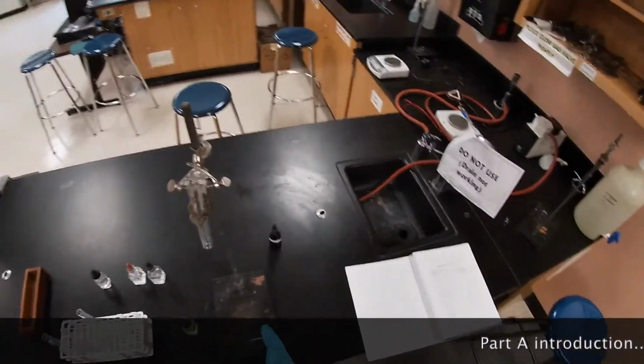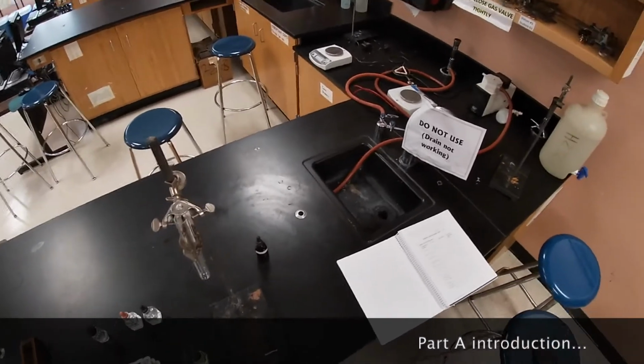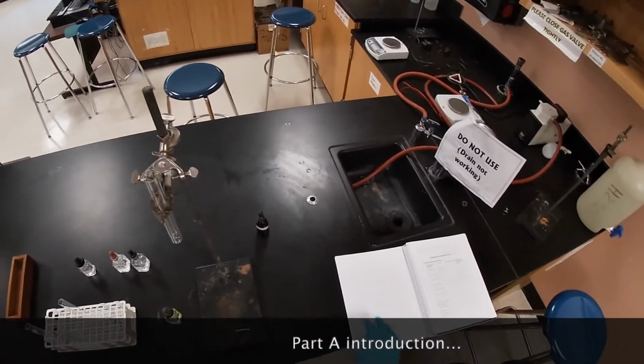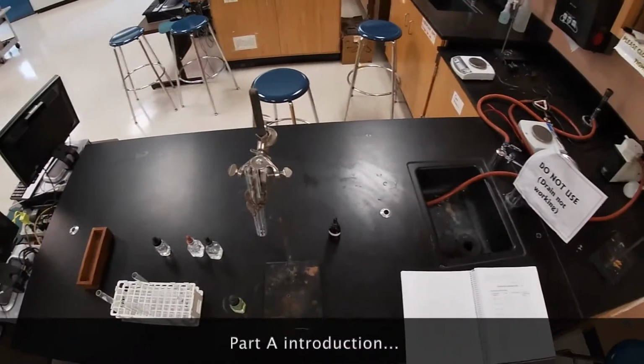So we're going to start working on Chemistry 1106, soluble and insoluble salts lab. This is lab number 15. And we're going to start off with part A.